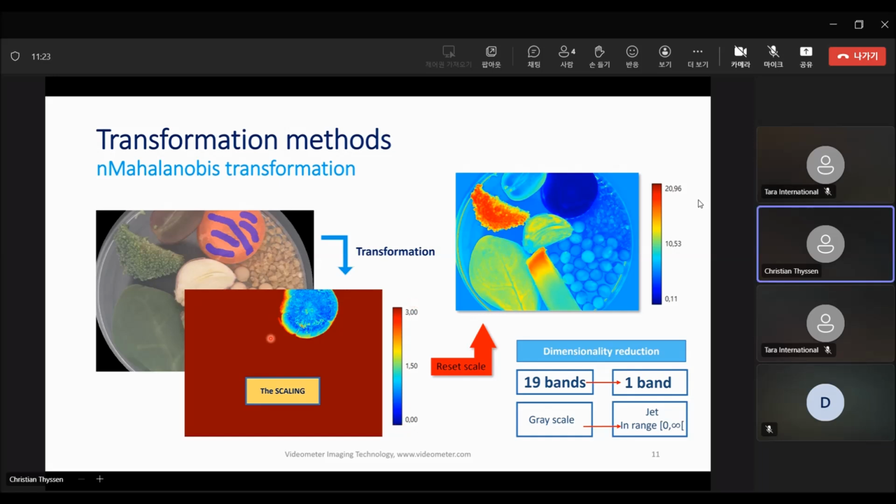So the distance from the orange color to itself is quite low because the color is blue here. So all these pixels indicate how close these colors are to the orange color. And of course, the color orange, or the color of the carrot, the distance to itself will be quite low. But you see, everything that is not orange colored will have a value of 3 or above. And the reason, in this case, all the values that could be, let's say 20 or 10, have just been capped at 3. That's why we get this image.